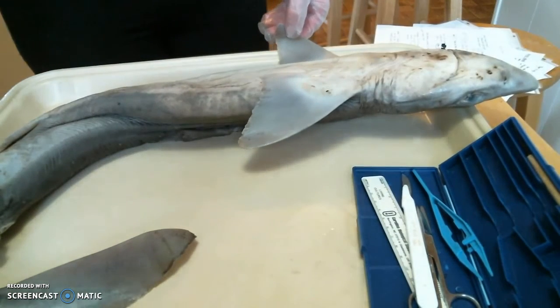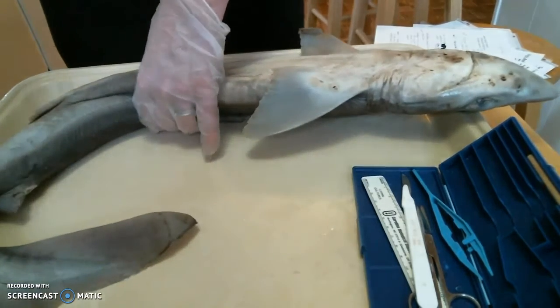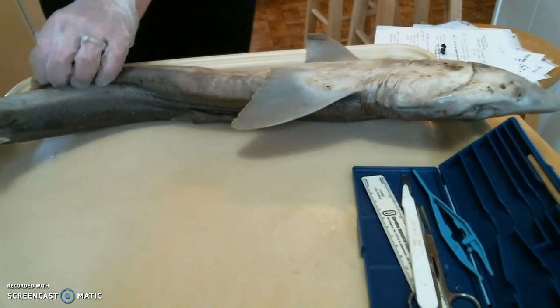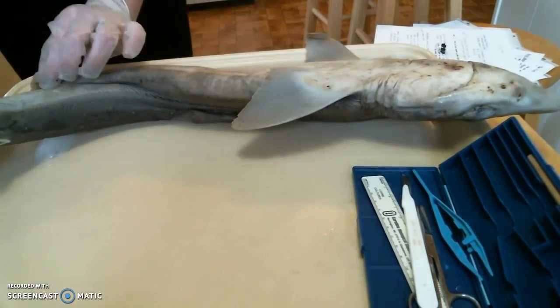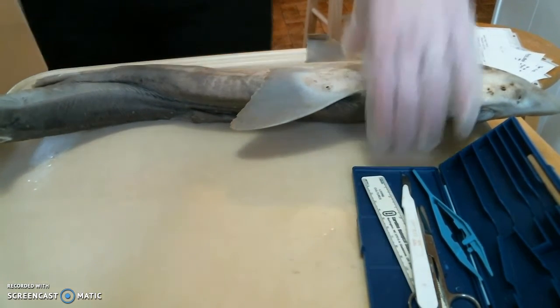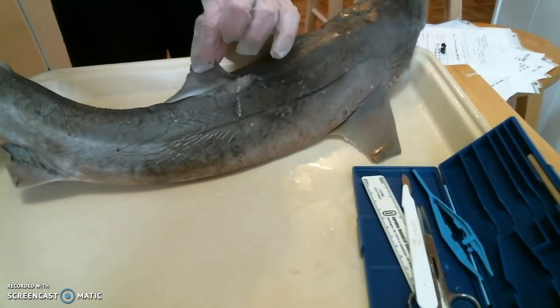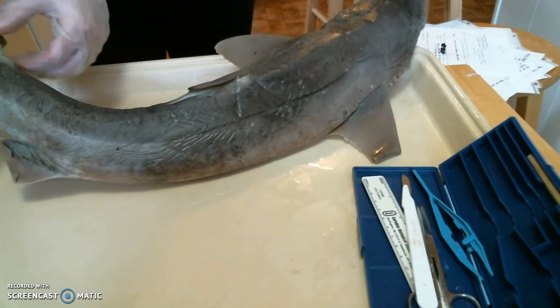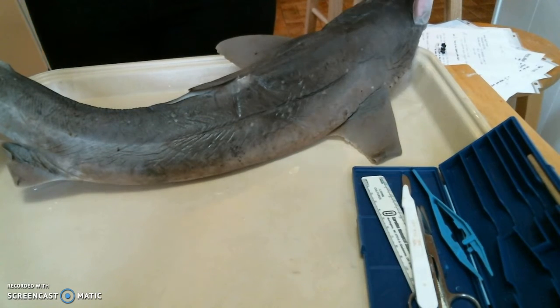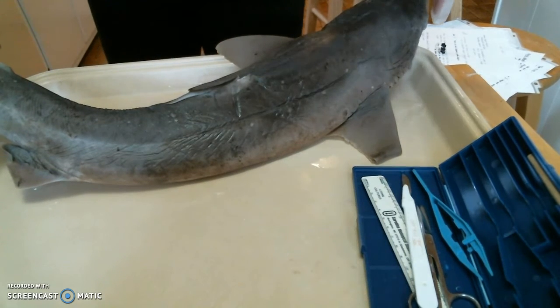And then, of course, you can look at the fins. So the caudal fin, we've got the two pectoral fins. I picked this one to dissect because it came broken. And then down here, all I really see are pelvic fins. I can't really make out a separate anal fin. And then it looks like we've got two dorsal fins on this side. One here, and then the secondary dorsal fin there. And then above its head are the spiracles here, and the eyes, obviously.